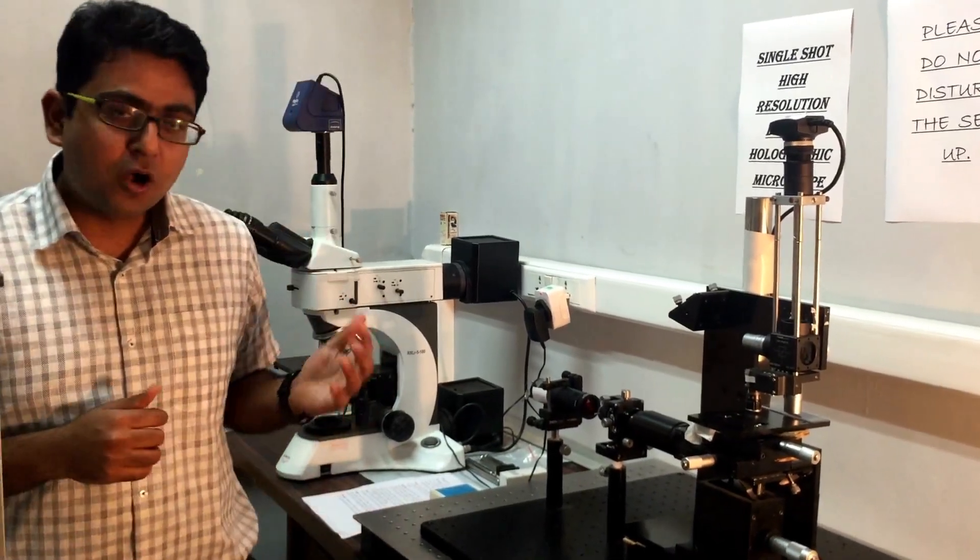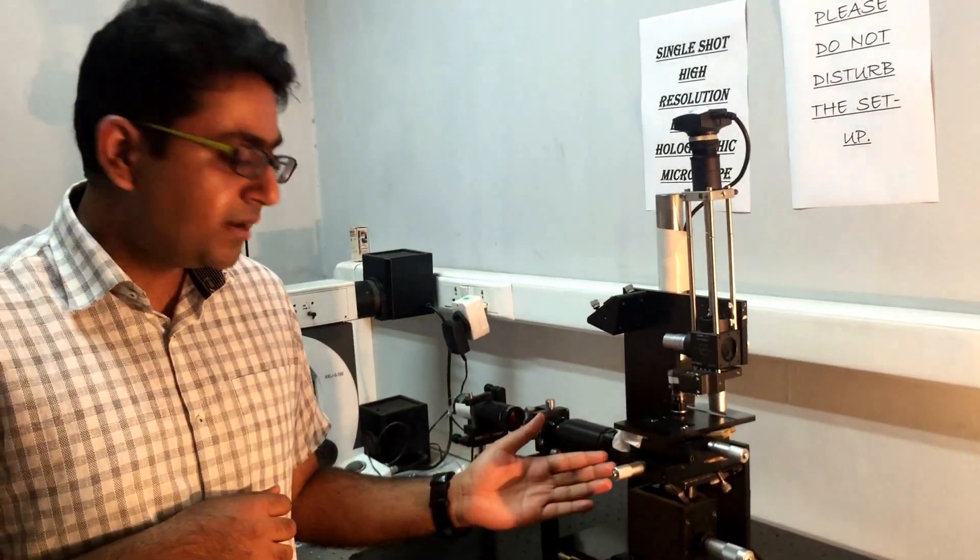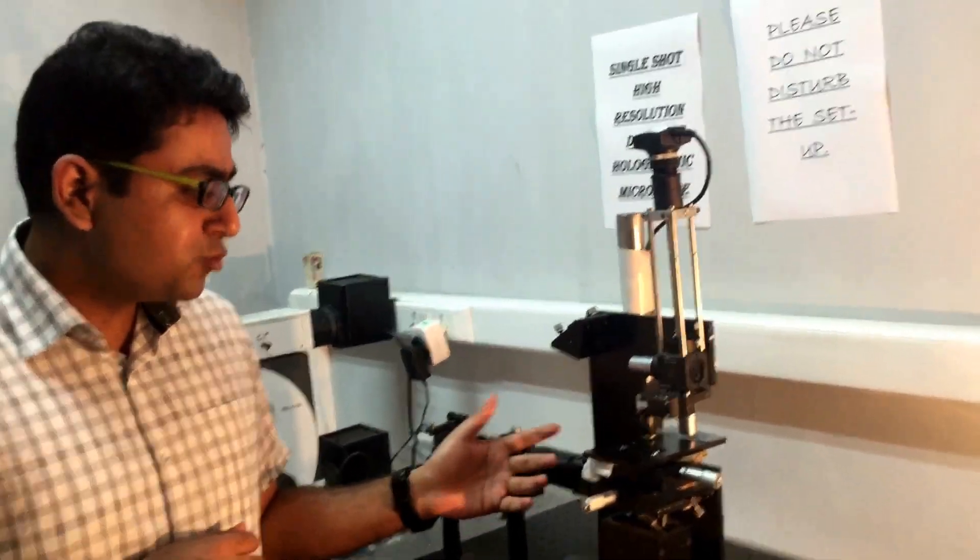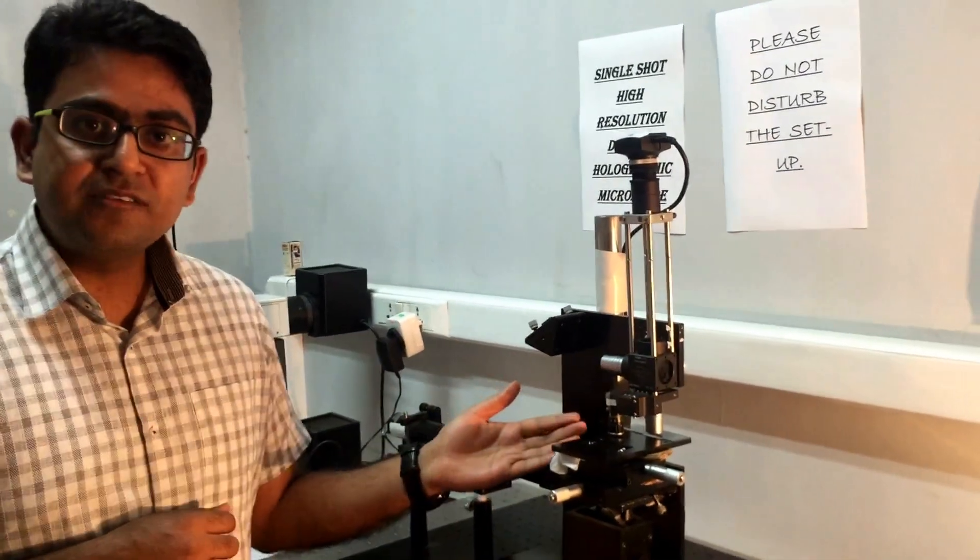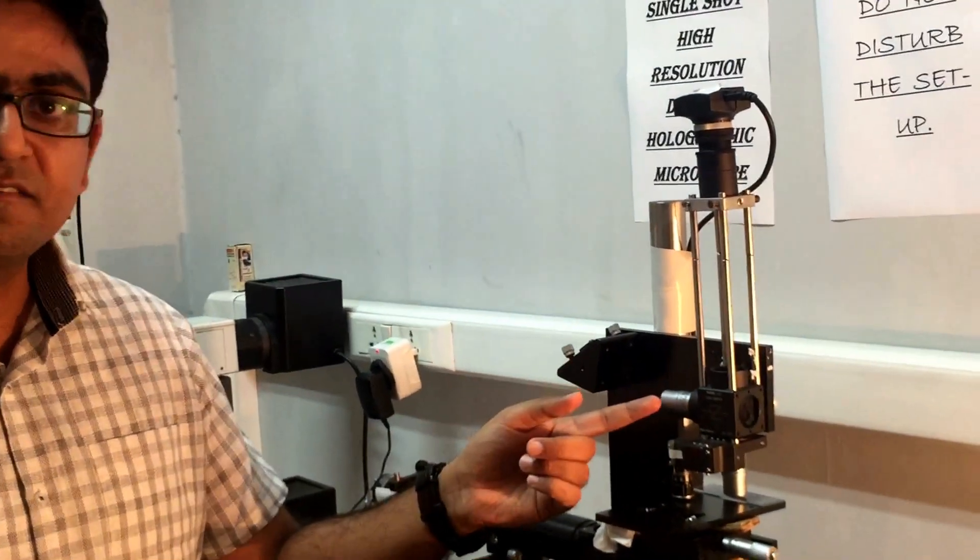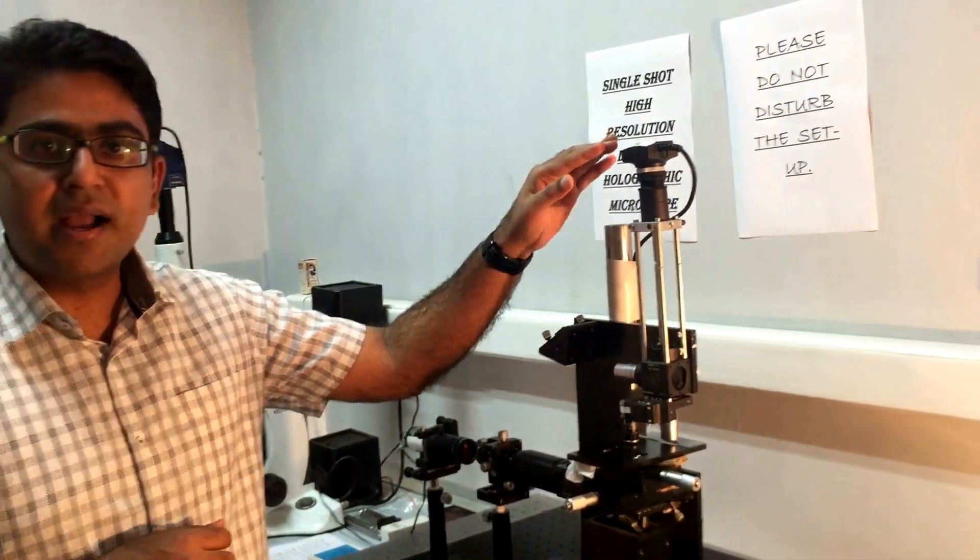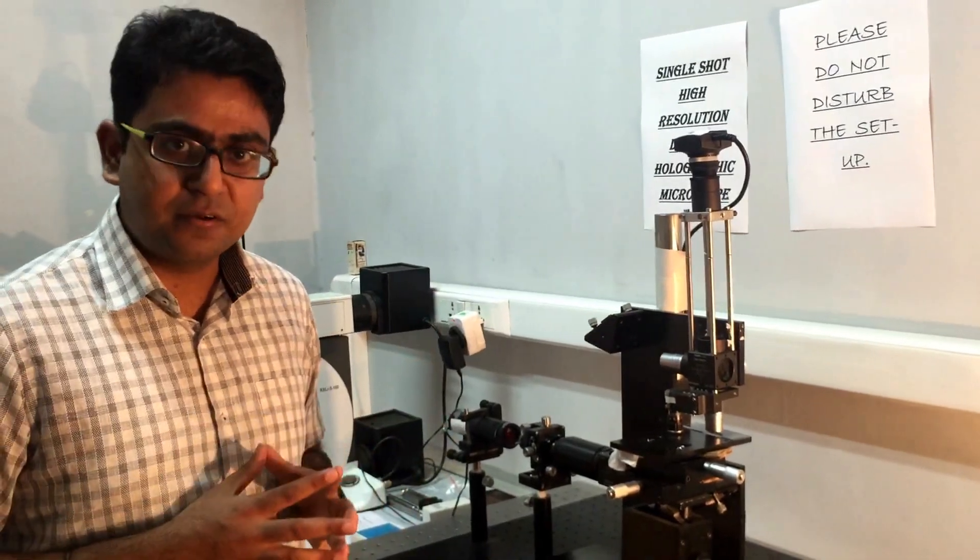Now let me show how it works. The laser beam arrives at this beam splitter and splits into two parts. One beam passes through the sample and the other is treated as the reference beam. Both beams combine at the detected camera plane and we record an interferogram.